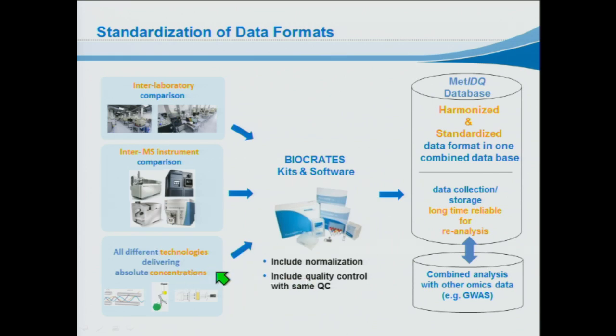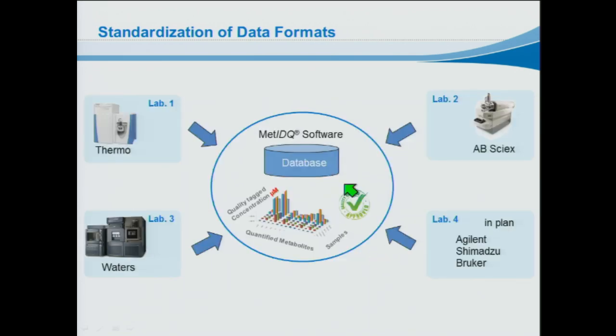So with the software, it is also possible to import concentration data, which comes from other technologies. It's just important that we have a molecule with an absolute concentration. Inside the database, we store the concentration in micromolar, so that makes it possible that you can compare the results across different projects. We have also technical validation, which I will show you later, so that the concentrations are all quality tagged. We have a project import-export feature in the software so that laboratories can move projects from one organization to the other, or that they can merge their data together to set up something like a global metabolomics cloud service, for example.